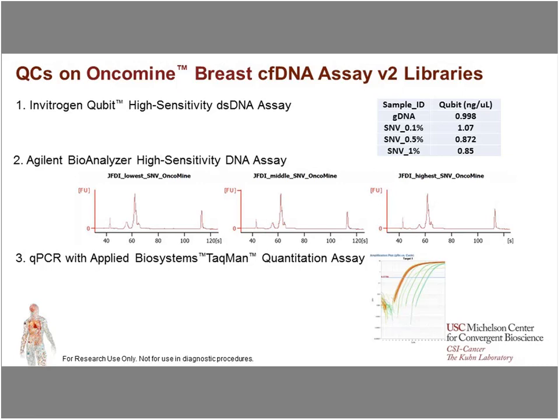Good profiles have small peaks on smaller fragments, smaller than 200 bp, and a big peak on the bigger than 200 bp side. This kind of profile will provide more useful reads and a higher alignment ratio after sequencing. The first small peak is the primer dimers from the system, and the large second peak is what we want with our inserts inside.